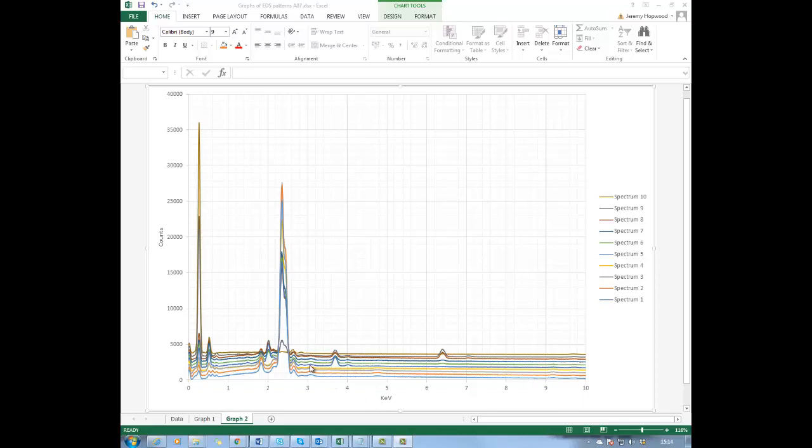At the moment they're all different colours. There's a couple of things really. Number one is they're pretty close together, so I think this offset of 400, probably 400 isn't right. So you have to use your own judgment a little bit on this one. The other thing is that it depends on what areas you're interested in, but the interesting area that I'm most focused on, I think, for the lead samples at least, is between 0 and 4.